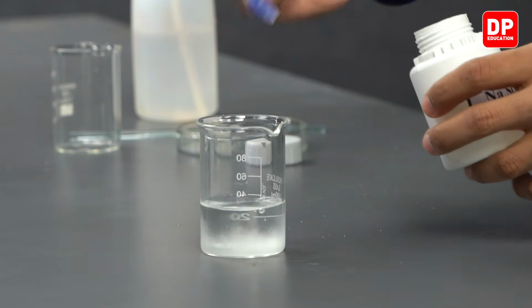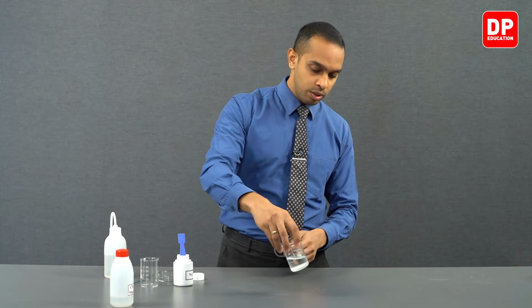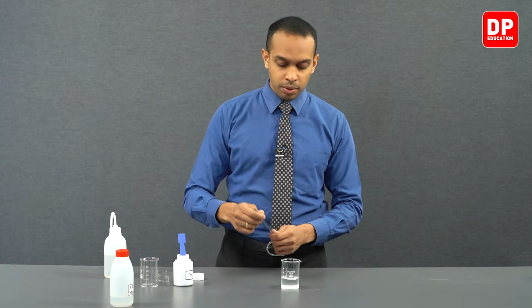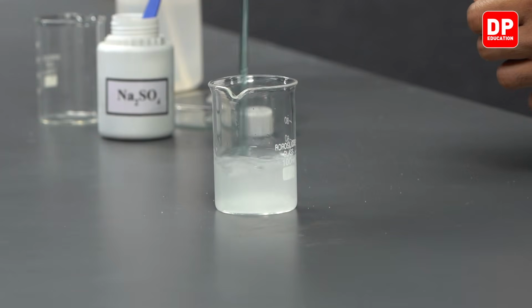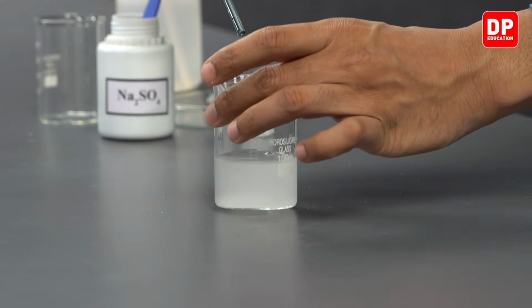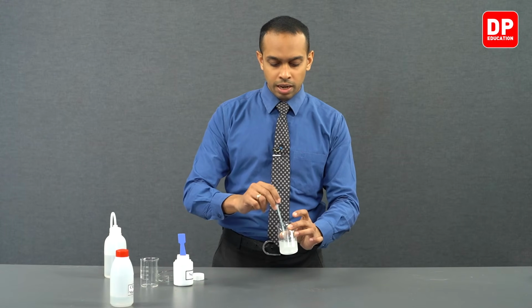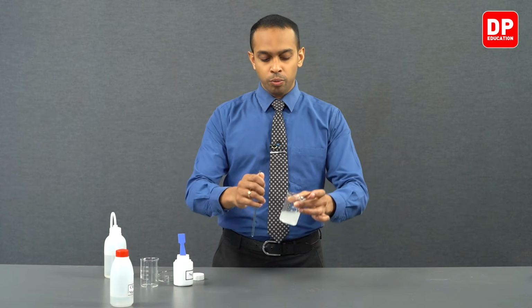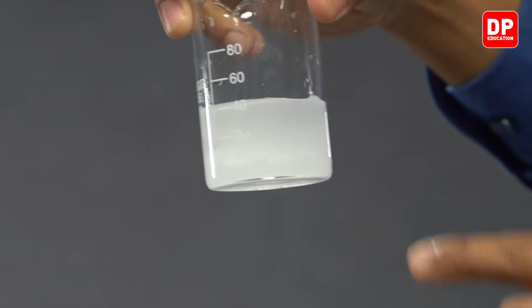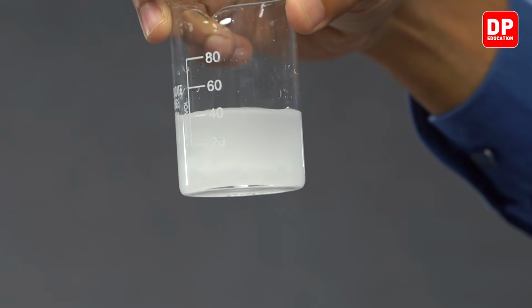We'll add 2 spatulas full of sodium sulfate into this water sample, and let's mix it really well. As you mix it, you will start to observe that the sodium sulfate is forming clumps. Students, can you see that the sodium sulfate is clumping together?